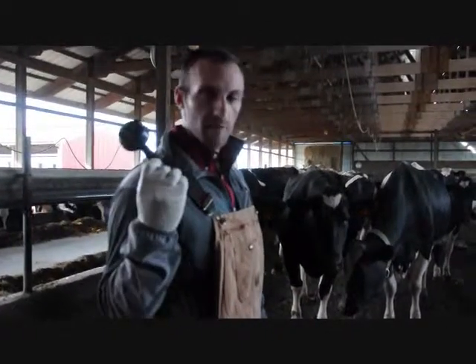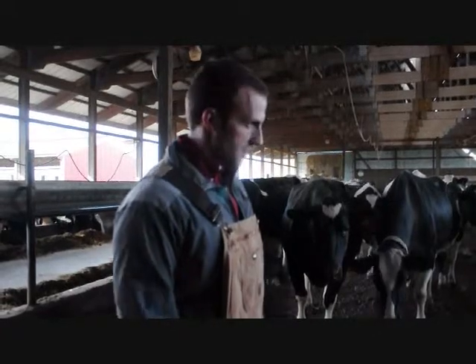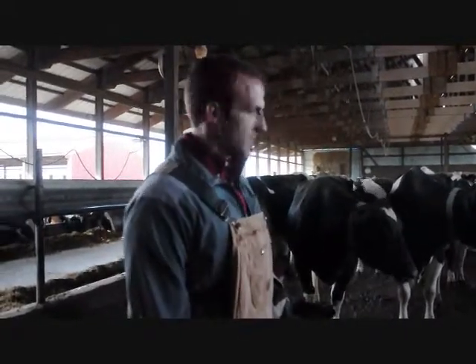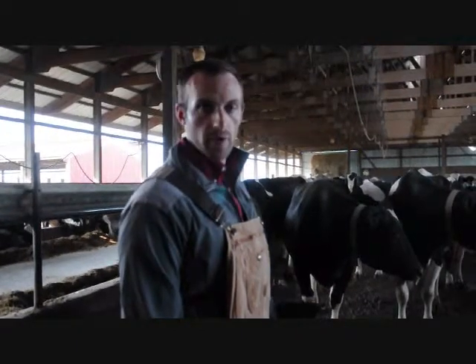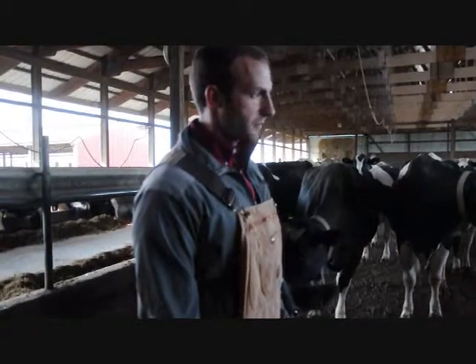Now we're going to take manure samples that will correspond to the TMR samples so that we can actually measure digestion through your cows. In a pen like this, we're going to take at least 10 manure samples. If it's a larger pen, we can take 15 or 20, or as many manure samples as you feel are necessary to accurately represent the pen.